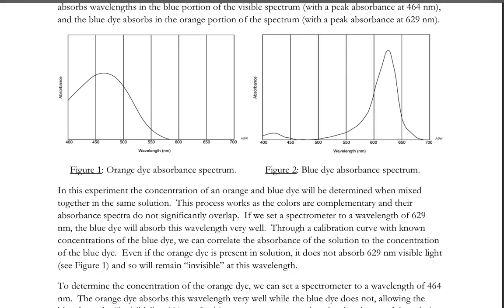We will, with the orange dye, make some dilutions, determine the absorbances of those dilutions, make a calibration graph, and then determine the absorbance for the orange component.